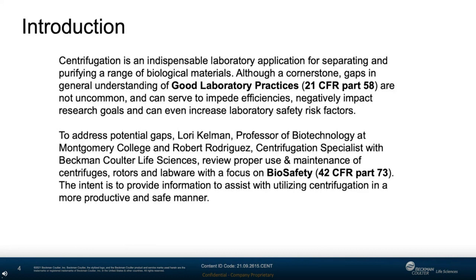Centrifugation is an indispensable laboratory application for separating and purifying a range of biological materials. Although a cornerstone, gaps in general understanding of good laboratory practices, 21 CFR Part 58, are not uncommon and can serve to impede efficiencies, negatively impact research goals, and can even increase laboratory safety risk factors.